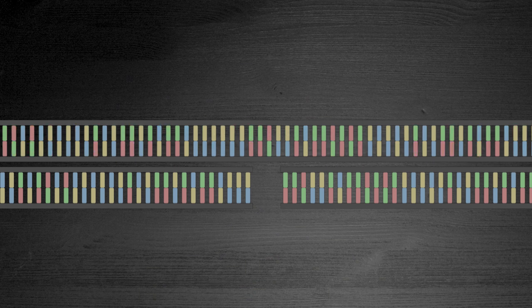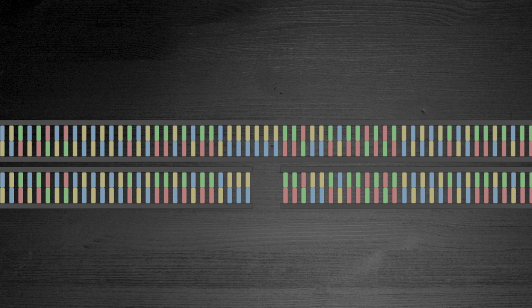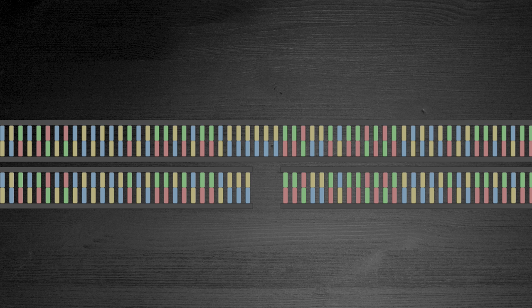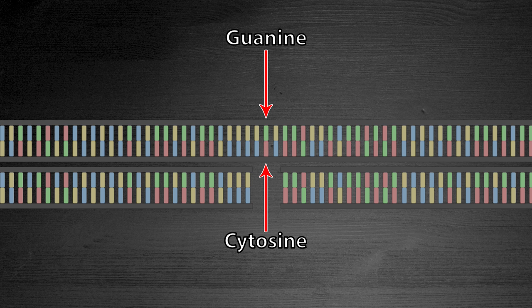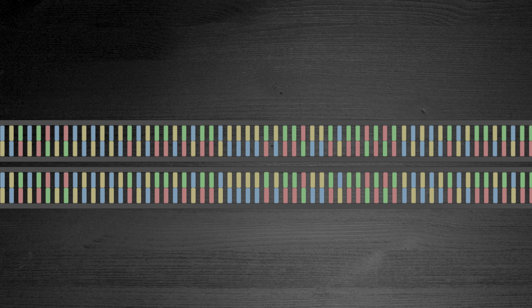The cell would then start to repair its cut DNA, but the custom DNA that we introduced works as a repair template, so the cell knows how to repair the cut. Our template DNA is nowhere near as large as the genome of the E. coli, but it's long enough to trick the E. coli to use it as a repair template, as it has identical base pairs on either side of the cut. The only change is one base pair: a guanine-cytosine substitution for a thymine-adenine base pair. That one change will prevent streptomycin from binding to the RPSL protein.